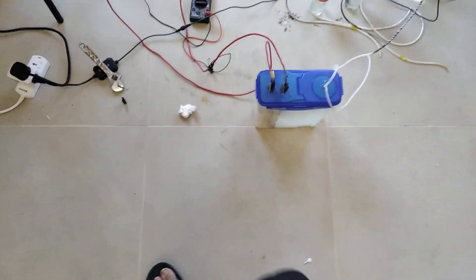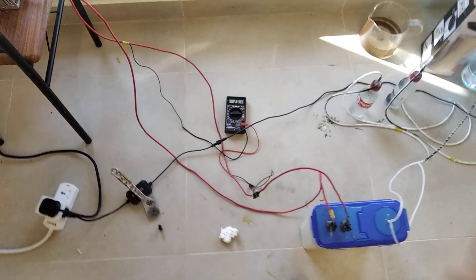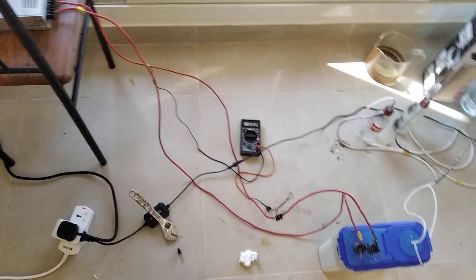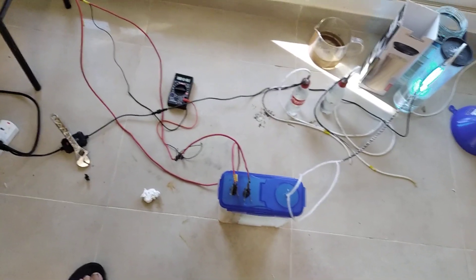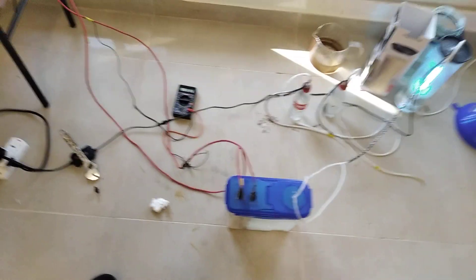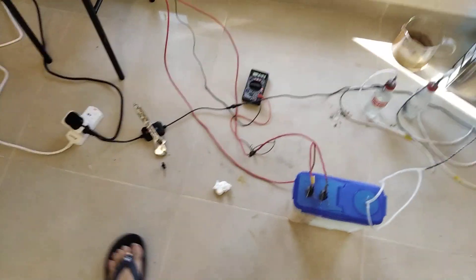So this is the updated setup of my HCL reactor. This is most likely gonna be the final setup because I think after this there's really not much more I can do.